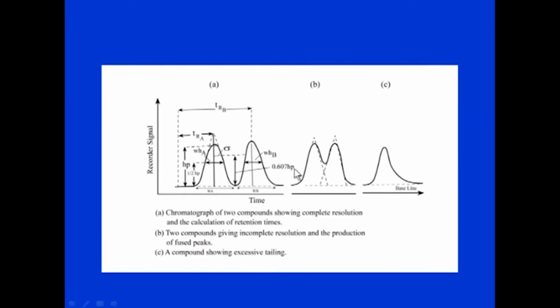For example, HPLC will give you very high resolution separation and very good, completely separate peaks, as compared to a simple gravity run chromatography system.